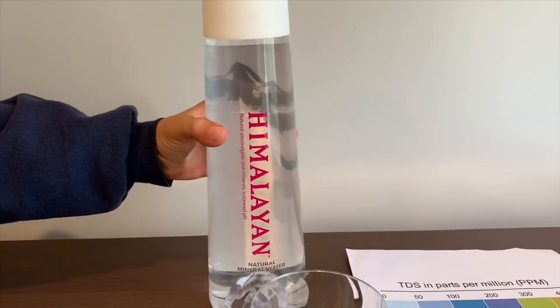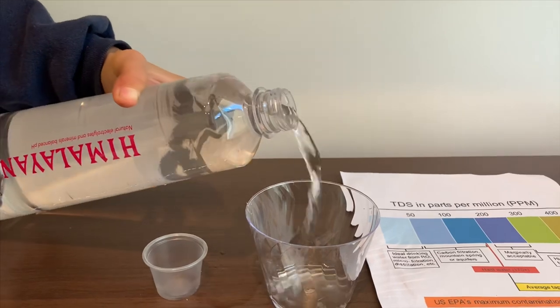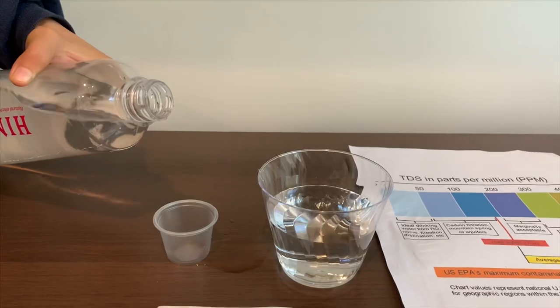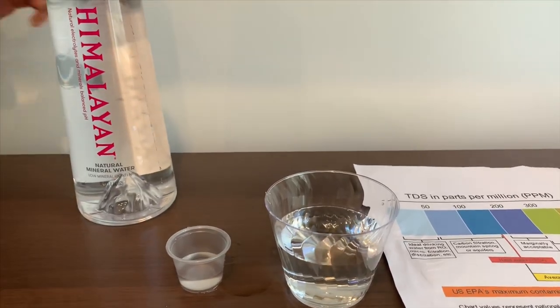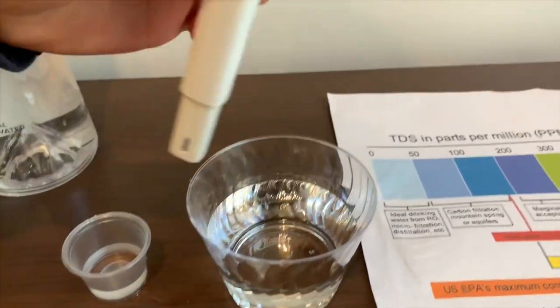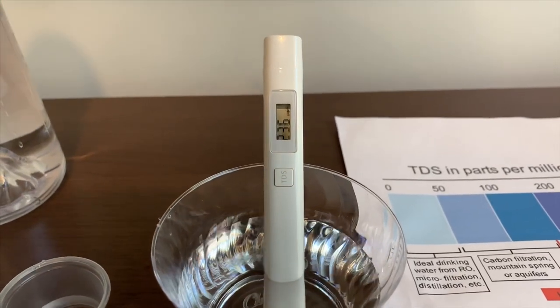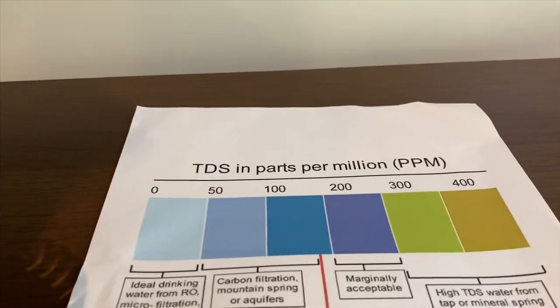Let's test the pH and TDS levels. Let's pour some water in. First we're going to test the TDS level. Turn on the TDS tester, make sure it says zero, and let's put it in. 236 — that's average tap water.